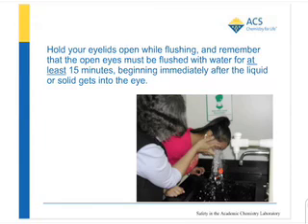Correct treatment of the eyes requires that the eyes be flushed for at least 15 minutes with tepid water. Very cold water will numb the eyes quickly, and you may be tempted to stop the flushing too early. Don't. Hold your eyelids open and flush the eyes for a full 15 minutes while someone else seeks medical help.